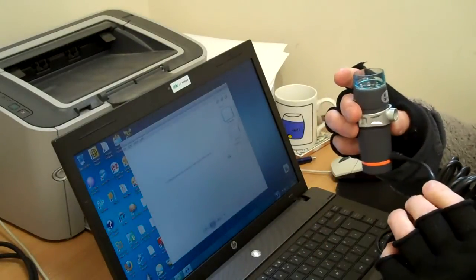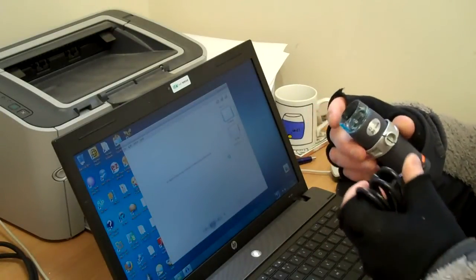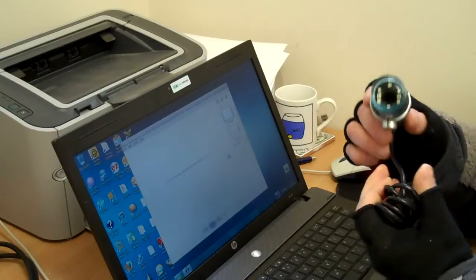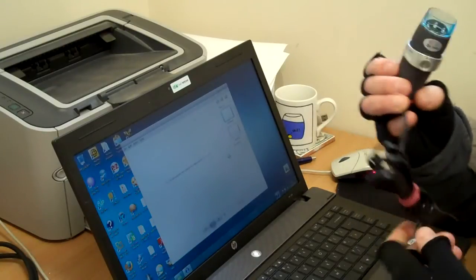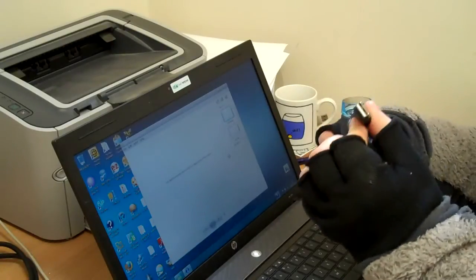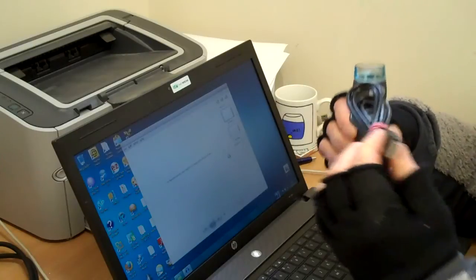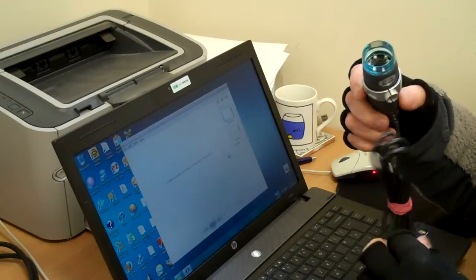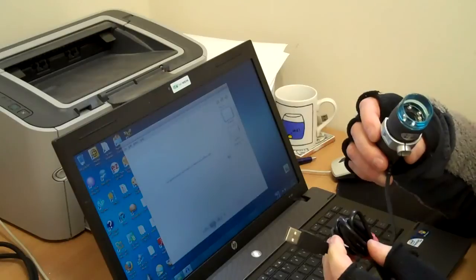Hello. This is a Celestron handheld microscope designed to be connected to your computer. It comes with USB and all the Windows software that you need.